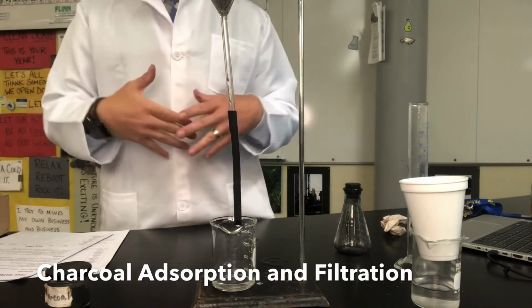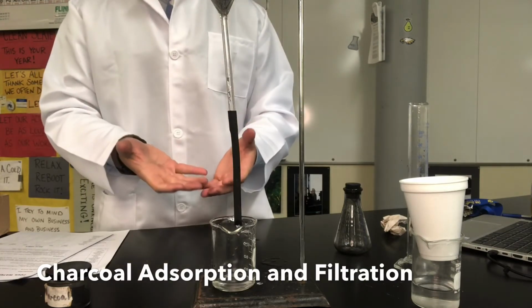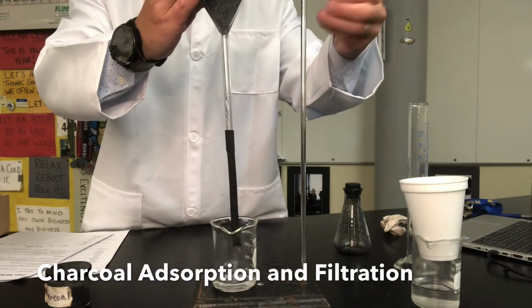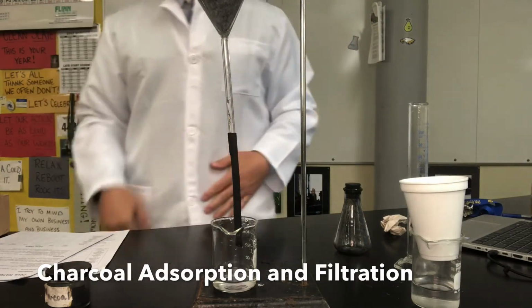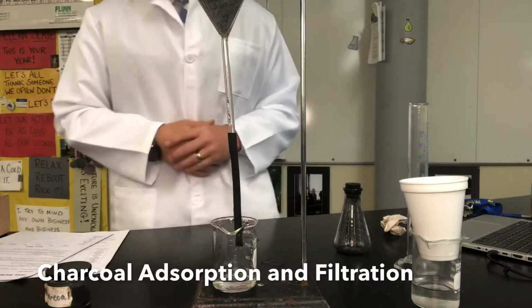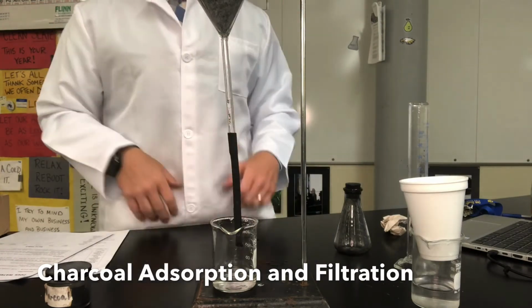Just like a coffee filter. The coffee grounds can't go through, just the liquid water can. It's another form of physical separation. So this is pretty awesome, and when we do this in class, a lot of students are shocked how clean the water's coming out. They don't believe it. But again, if you ever make coffee, you've seen this phenomenon before. It's just filtration, and you're using gravity to pull the liquid down.